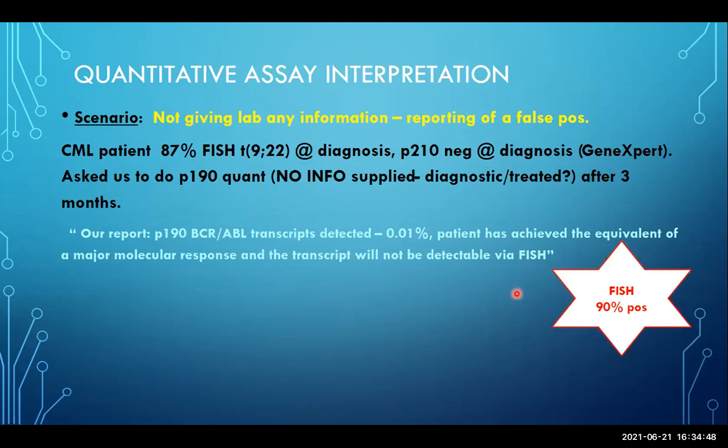So before pulling my hair out and thinking, oh my goodness, what is going on here? The key thing is that this is where it's really important, when you do MRD and you're doing quantification assays, that the test is the correct one for the job. When it comes to BCR-ABL, there are several different isoforms, and unfortunately, the primers can bind to different transcripts, giving low-level amplification for the wrong ones but high-level amplification for the correct one.